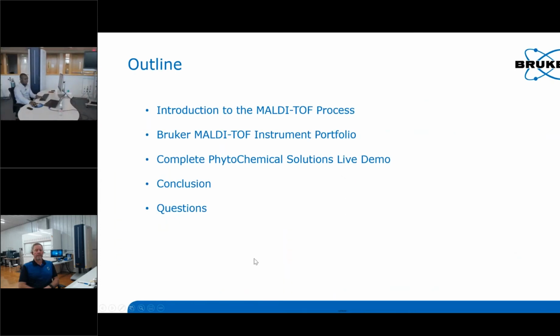So now I will turn it over to Chris for a more hands-on and live demonstration of how you can use MALDI to identify adulterated cranberry foods and products. Just a few words of introduction about Chris. Chris is the CEO of Complete Phytochemical Solutions with over 25 years of experience at the University of Wisconsin-Madison as a phytochemist, specializing in the development, validation, and harmonization of mass spectrometry methods for the authentication of dietary supplements, foods, beverages, all types of applications, basically.